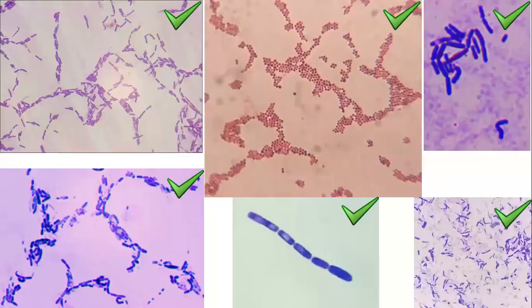The ultimate objective of gram staining is to see whether it's bacteria. First of all, to study the morphology, whether it's cocci, coccobacilli or bacilli. Then we need to know the cell wall composition, whether they are rich in polysaccharides or lipopolysaccharides. Gram positives are rich in peptidoglycans, which makes them purplish in color.